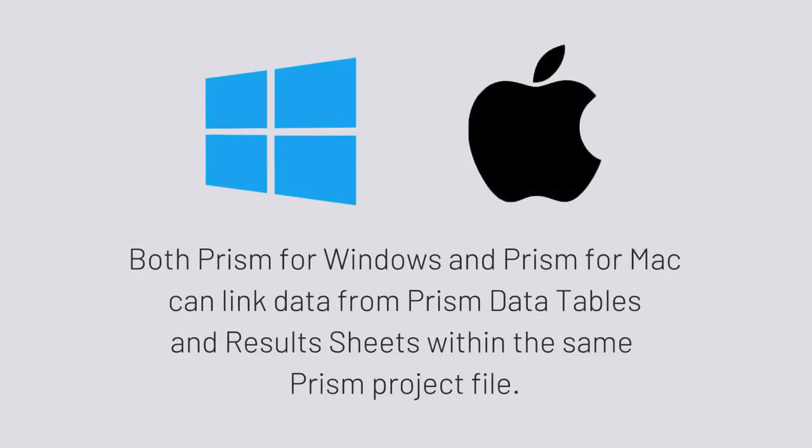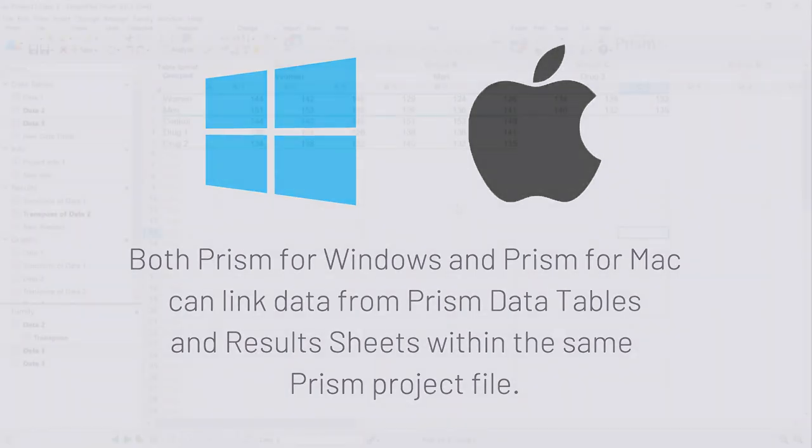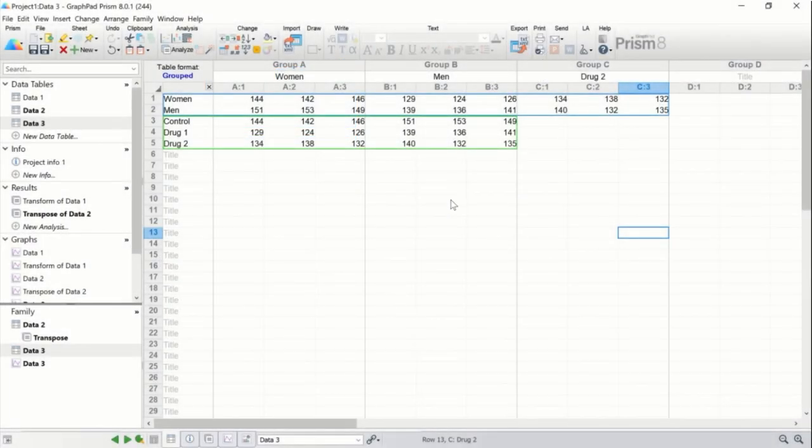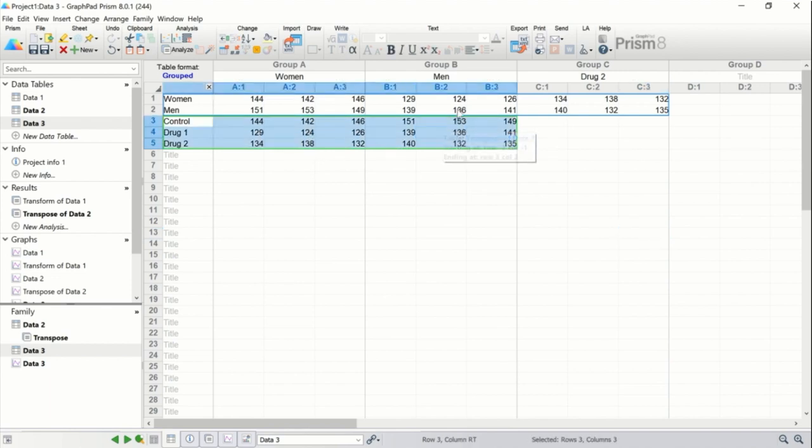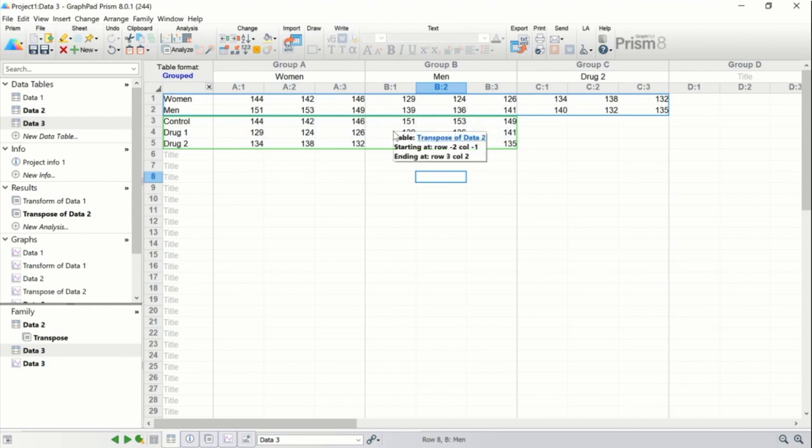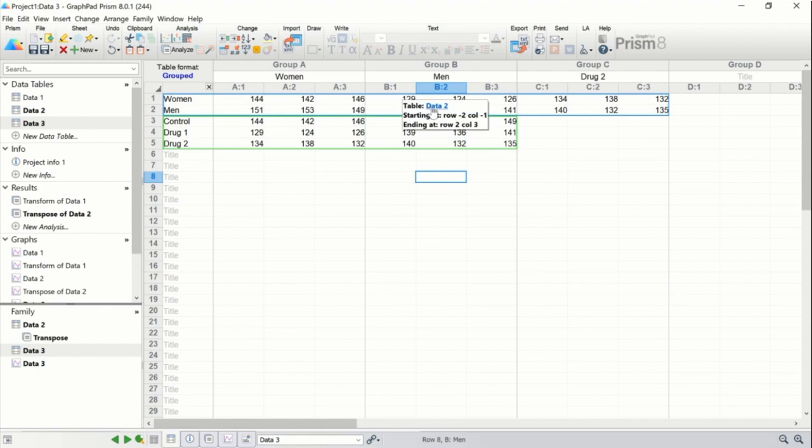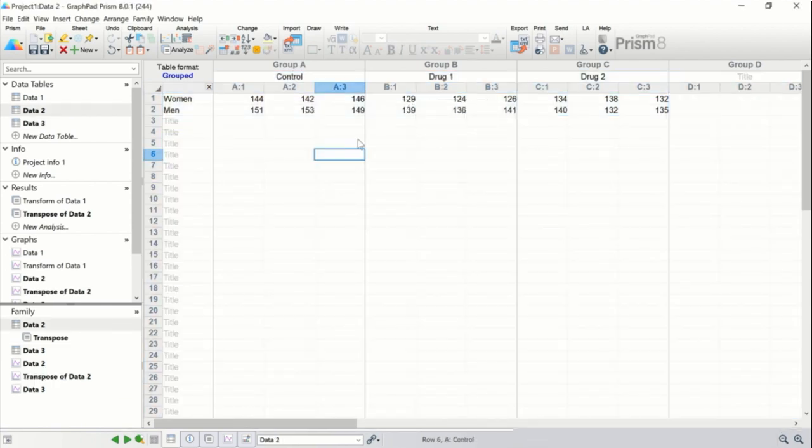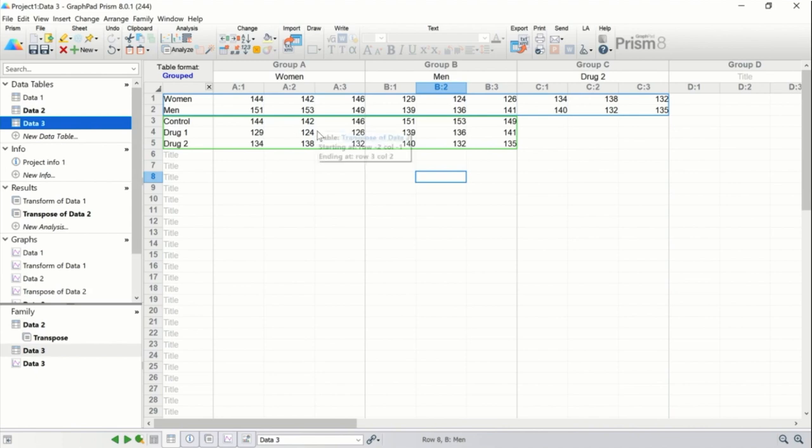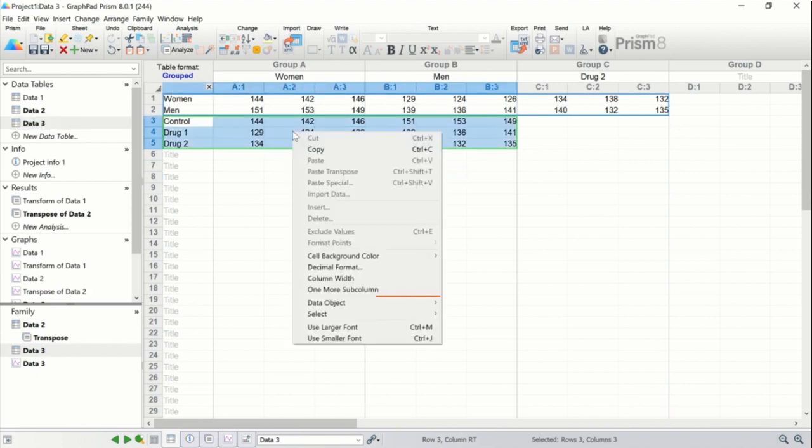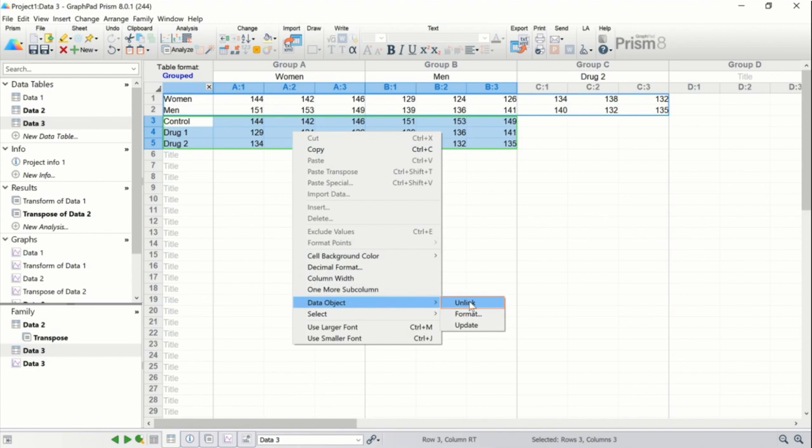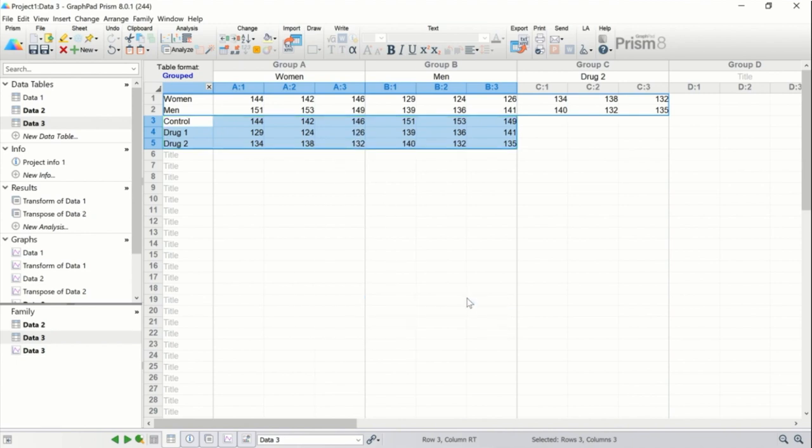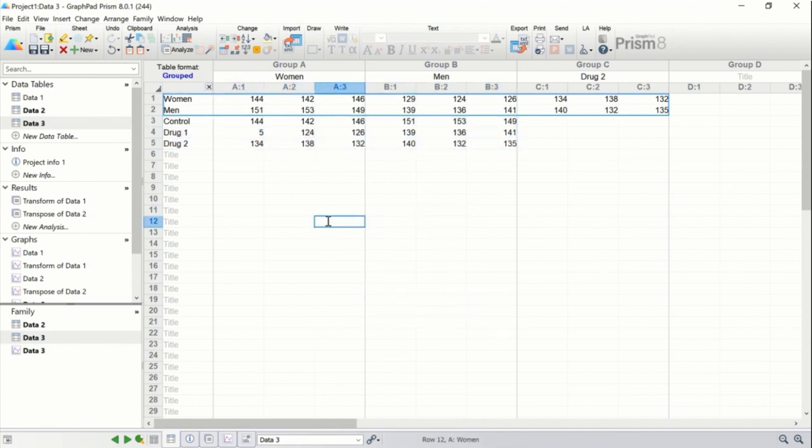Note that both Prism Windows and Prism Mac can link data from Prism data tables and results sheets within the same Prism project file. Also note that if you click on any part of the linked data, you'll find that you can't directly edit the linked data. However, if you hover over the data with your mouse, you'll see where the data is linked from, and you can click on the link to go to the source data. Additionally, if you choose, you can unlink the data by right clicking within the linked data object, going to data object, and selecting unlink. This will allow you to alter the data in the sheet, but will result in the data no longer being updated if the source data are altered.